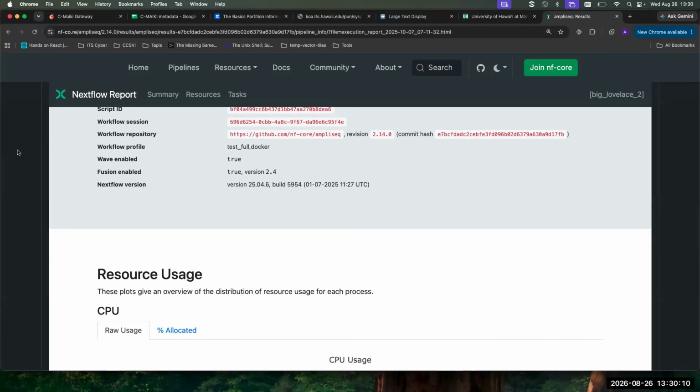We should have a user community for some of the core things that people do. For 16S, I think that's pretty well established. I tend to field a lot of the 16S questions. I would love to not be fielding all those 16S questions. So I used to teach a class that built that user community, and I will do that again if we have a big user community. That user community has dwindled. I think ITS, for example, I just figured out that our ITS pipeline isn't working great, and that's because we don't have a good ITS user community.